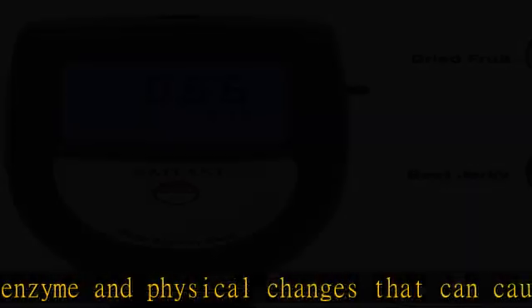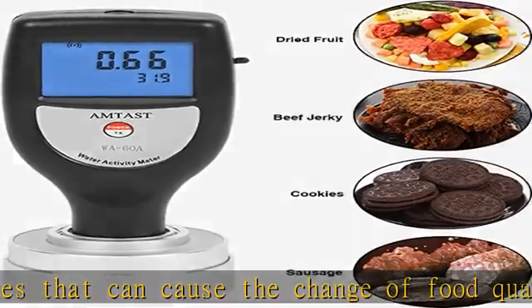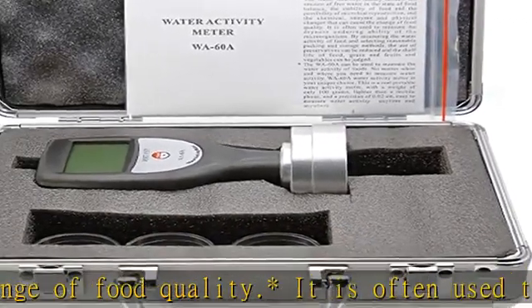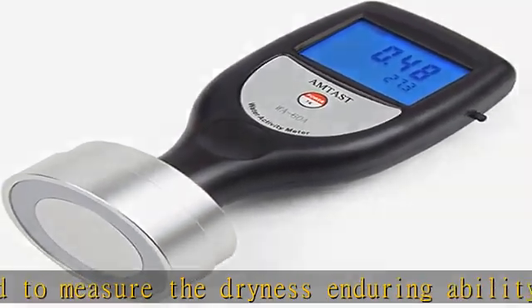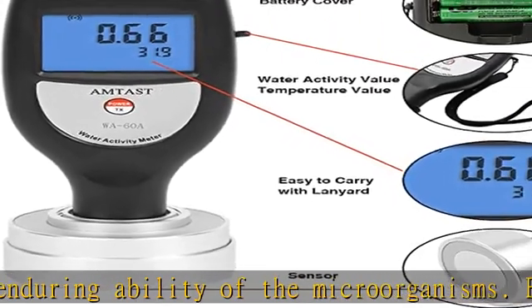This is a real portable water activity meter with a weight of only 100 grams — lighter than a mobile phone — and a precision of 0.02. Easy to measure water activity anytime and anywhere. Water activity and temperature of the samples are displayed together. Use USB data output to connect with PC.